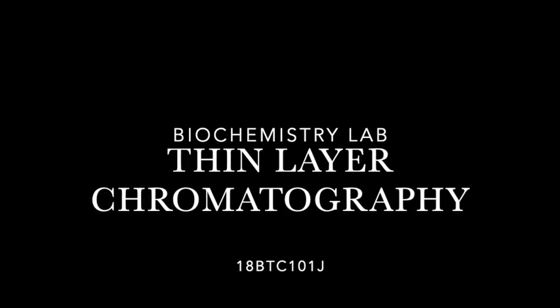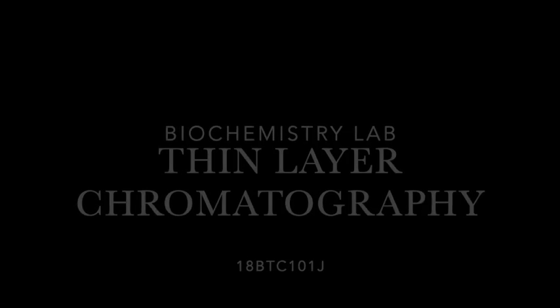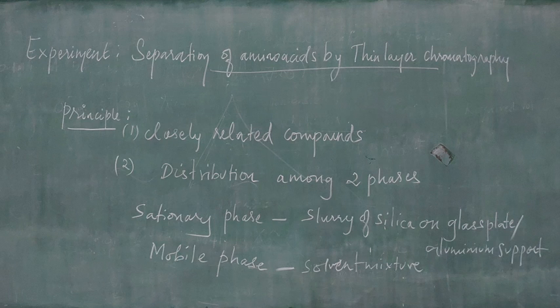The experiment for today is about separation of amino acids by thin layer chromatography. The principle behind the experiment is that the separation can be done based on the distribution among two phases, namely the stationary phase and the mobile phase. The stationary phase used in this experiment is the thin layer of silica applied on the glass or aluminum support. The mobile phase is the solvent mixture used in this experiment.